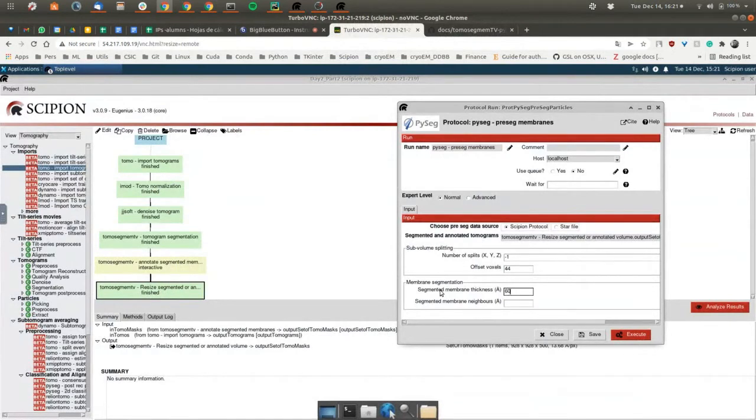And the biggest ribosome size is about 300 angstroms, and we're going to leave an error margin of 10%, just to ensure that we are covering all the possible roundings in the calculations and so on.